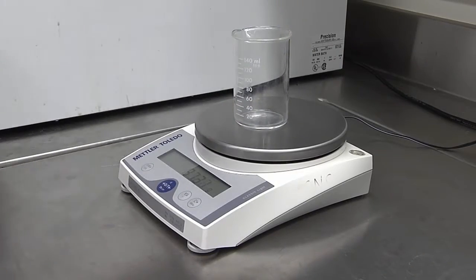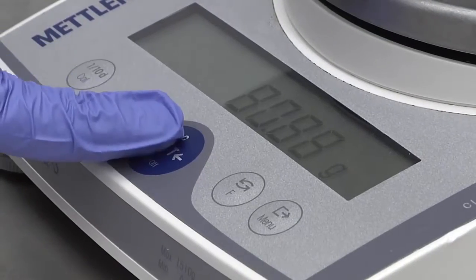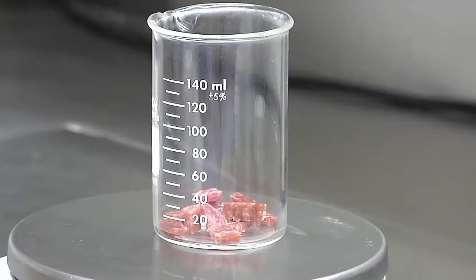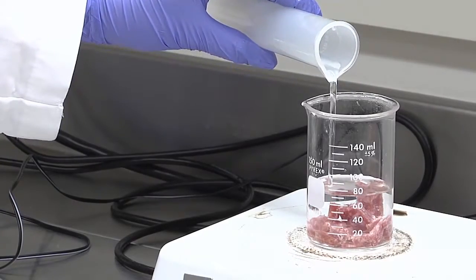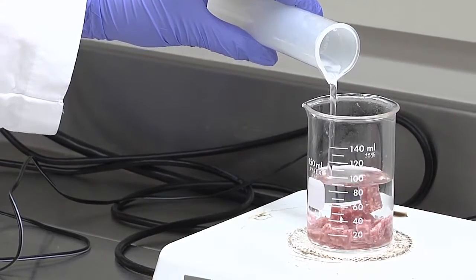First, tare the beaker on the scale. Place 10 grams of the ground meat product in the beaker. Next, add 90 milliliters of distilled water to the beaker.